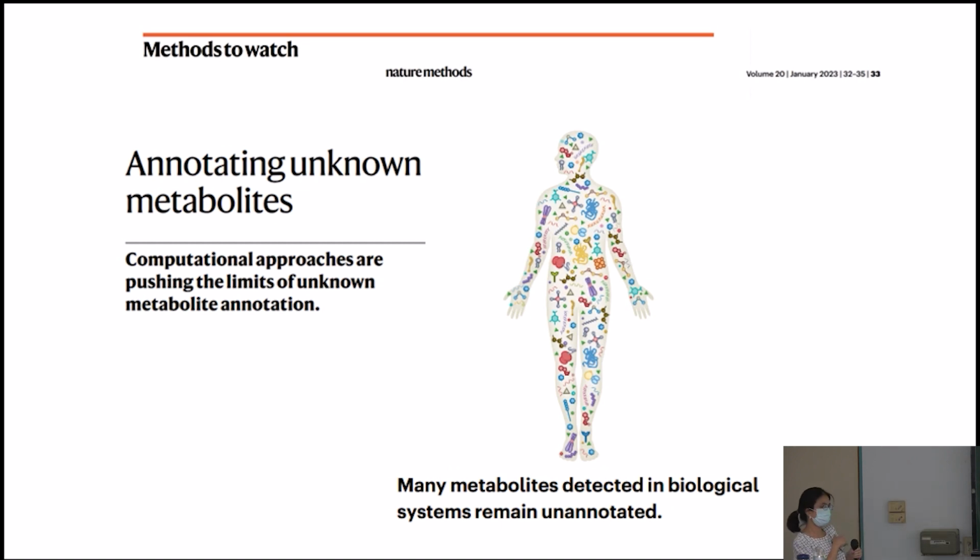Okay, so we will start our second section. This method to watch is focusing on annotating unknown metabolites, and it was published earlier this year.